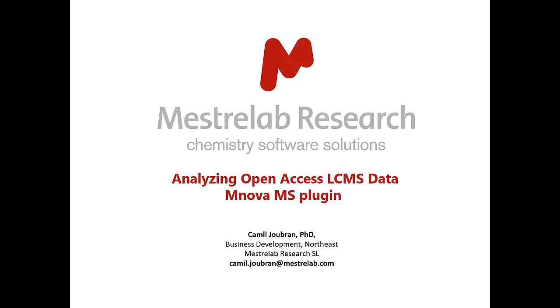Some of you may be running a Waters system using OpenLynx software or using Diversity Browser on your desktops to look at the data afterwards, or you might be using Agilent and OpenLab, whatever software you're using. The Mnova plugin is a very general software that can integrate any kind of data types.